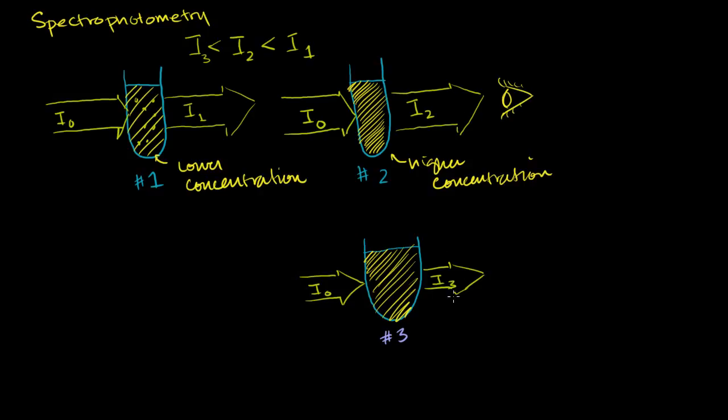That makes complete sense. If you dissolve a little bit of something in water, it'll still be pretty transparent. If you dissolve a lot of something in water, it'll be more opaque. And if the cup that you're dissolving in, or the beaker that you're in, gets even longer, it'll get even more opaque. So hopefully that gives you the intuition behind spectrophotometry.